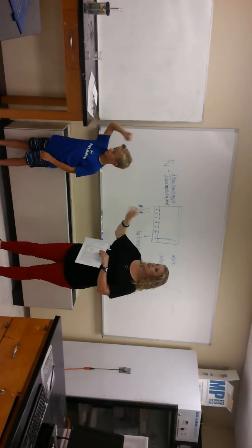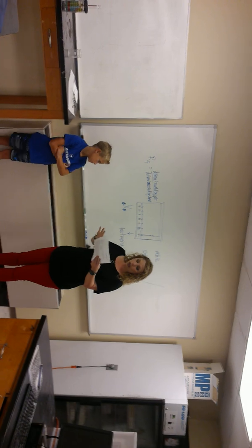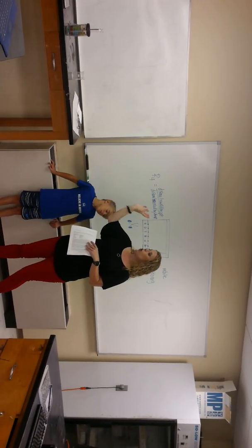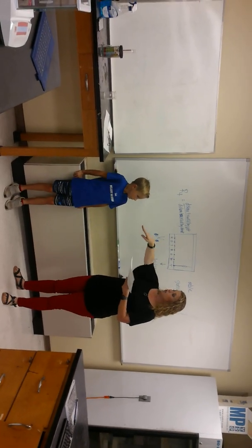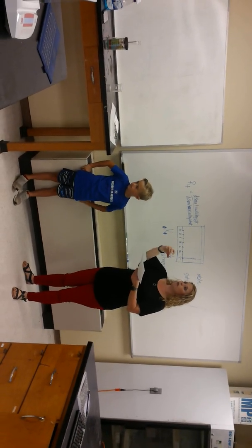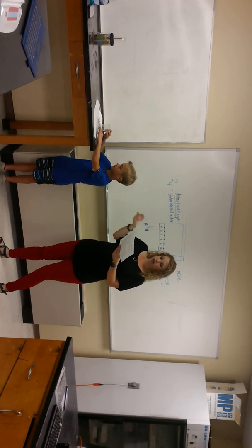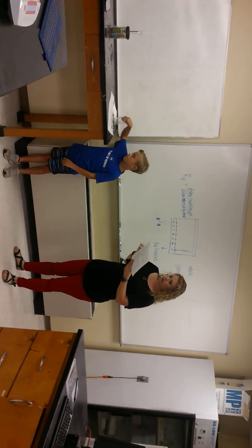So then you're going to dye your yarn. It tells you about how to do that. Once you've boiled it the length of time it tells you, then what you're going to do is pour off that solution, okay? Now, again, pour it into a waste beaker, pull your yarn out, okay? Now we have to take that dyed yarn and remove the dye from there, okay?